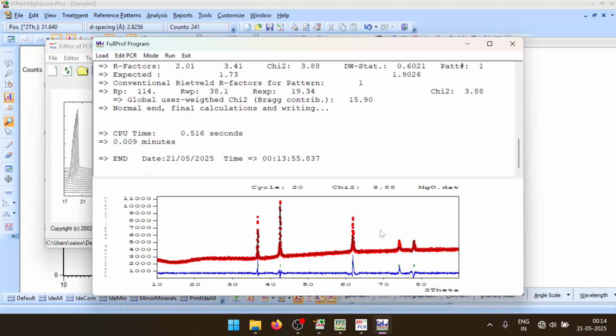So once you have the correct pattern of your material, like if I try to fit a multi-component oxide with the same pattern, it will fit nicely. I have done that, and I've made plots where it fits nicely. So fit the correct material. This is just to show how to fit a material for a basic and beginner user. Once you have your data, keep trying, you will eventually get there.